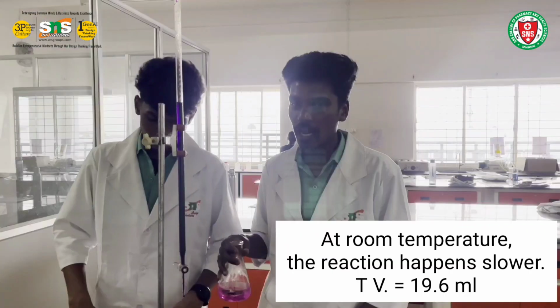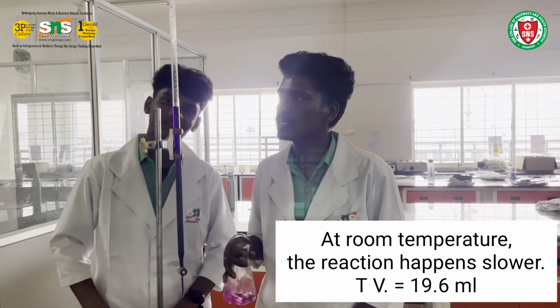At room temperature, the titrant value is 19.6.